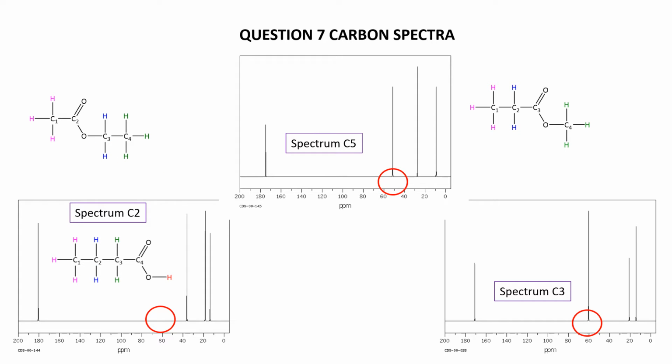Now let's quickly go through and assign which carbons they are. Obviously this one up here is the acidic carbon, C4, and then as we march away from that acidic carbon, C3, C2, C1, we of course get further away from the nasty electronegative atoms, so I would expect a little progression: C3 is the next one, and then C2, and then C1. Okay, so C2, this acid here, without much doubt.